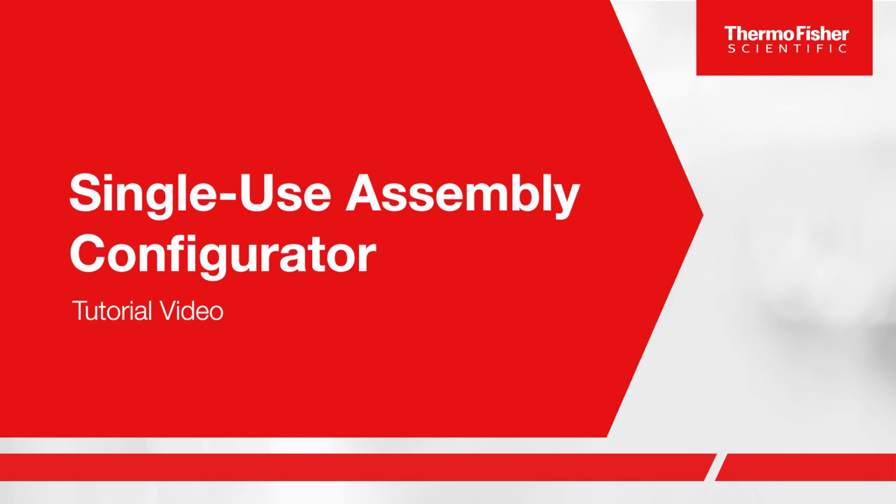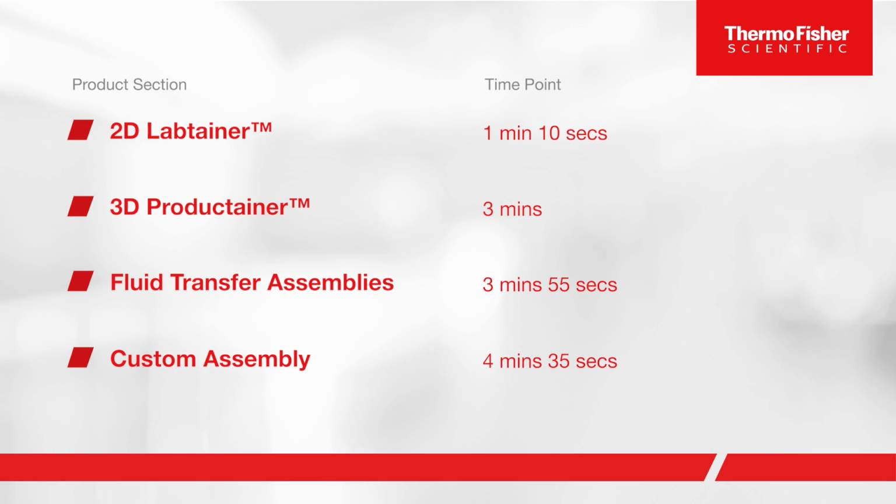Welcome to the Thermo Fisher Scientific Single-Use Assembly Configurator. Today we will guide you through the tool and its features with these product examples.